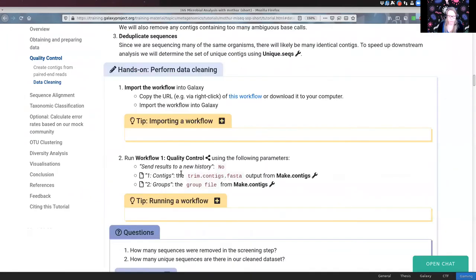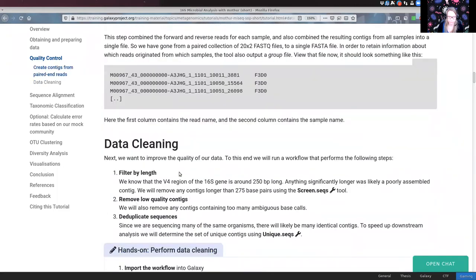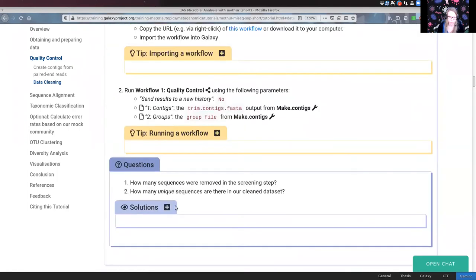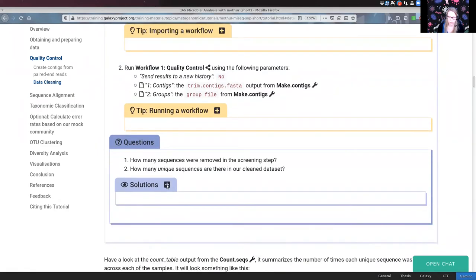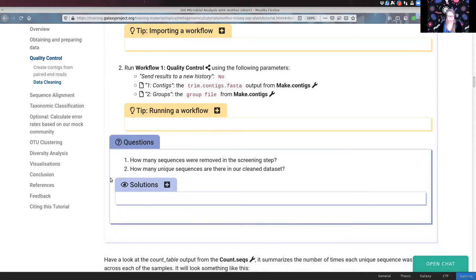While we wait for the results, the screen.seqs step will do some filtering and cleaning to remove low-quality reads. Two questions to answer when your data is ready: how many sequences were removed in the screening step, and how many unique sequences do we end up with in our clean dataset.